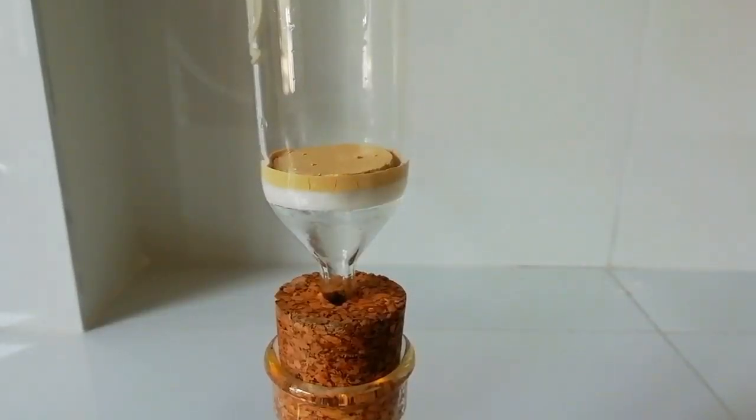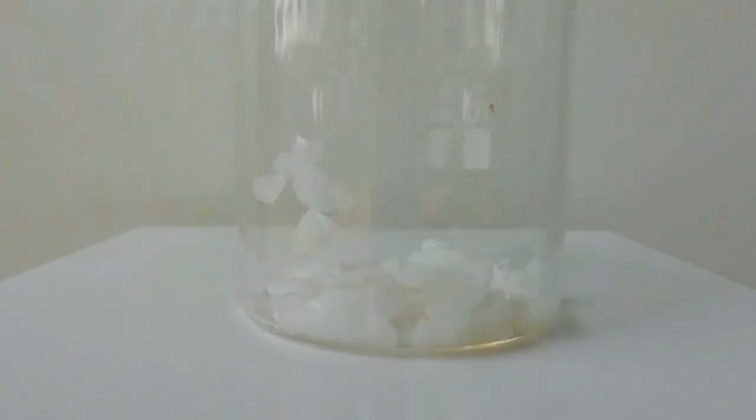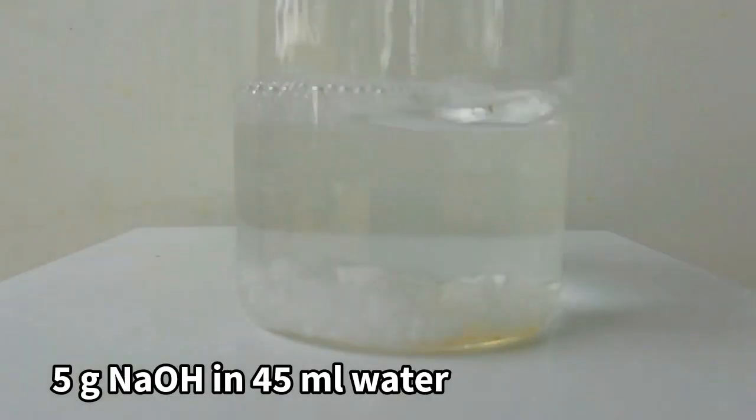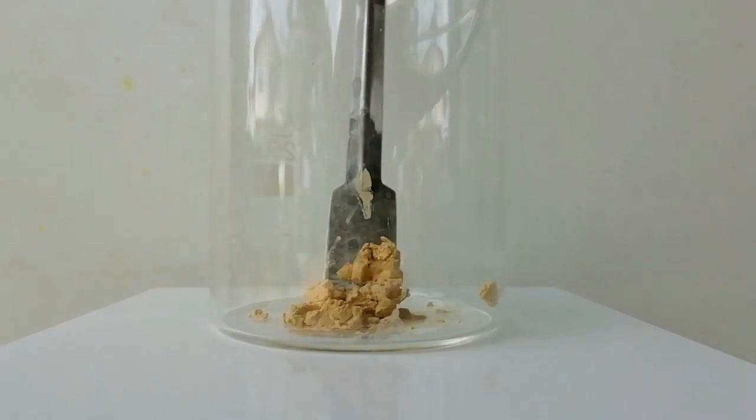Then to convert nitrate group to amine group we need to dissolve the precipitate. For that I prepared 10% sodium hydroxide solution by dissolving 5 grams of sodium hydroxide in 45 ml of distilled water. When the precipitate dissolved in sodium hydroxide the solution turns into red color.